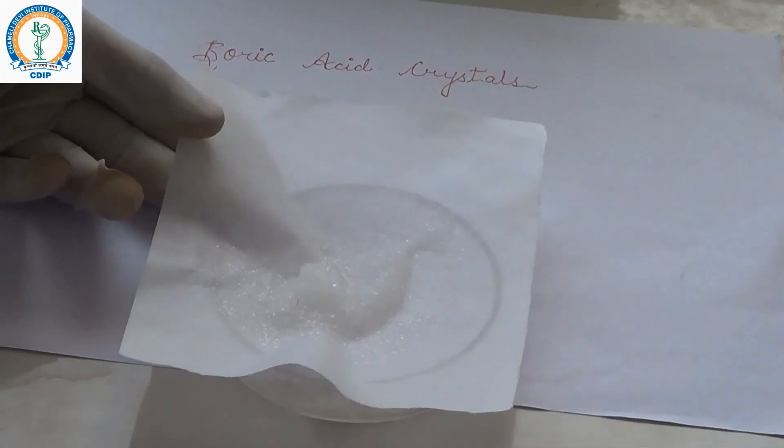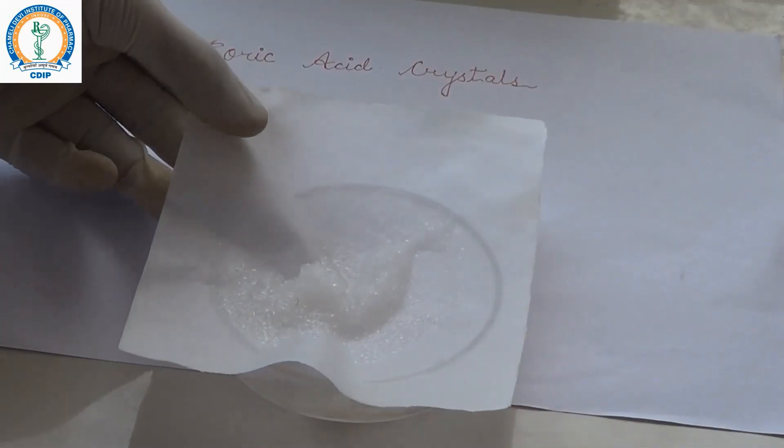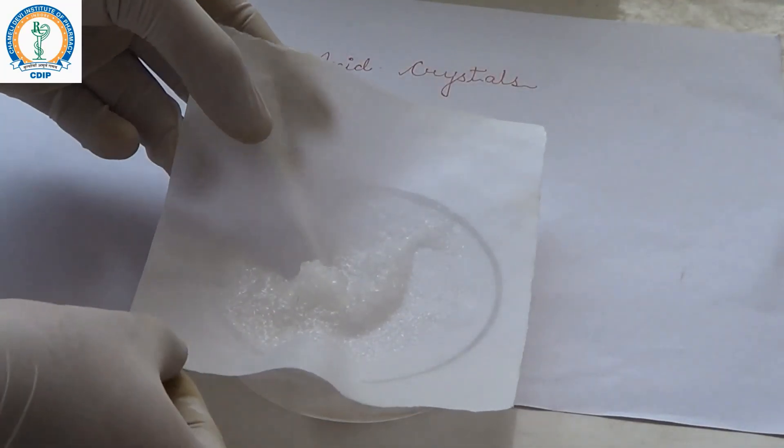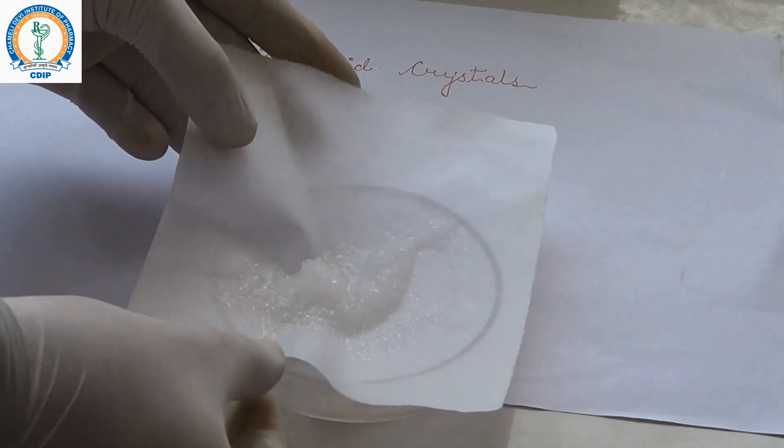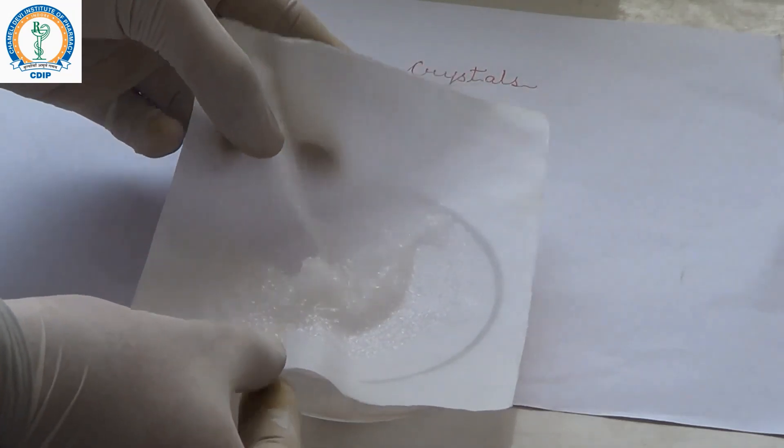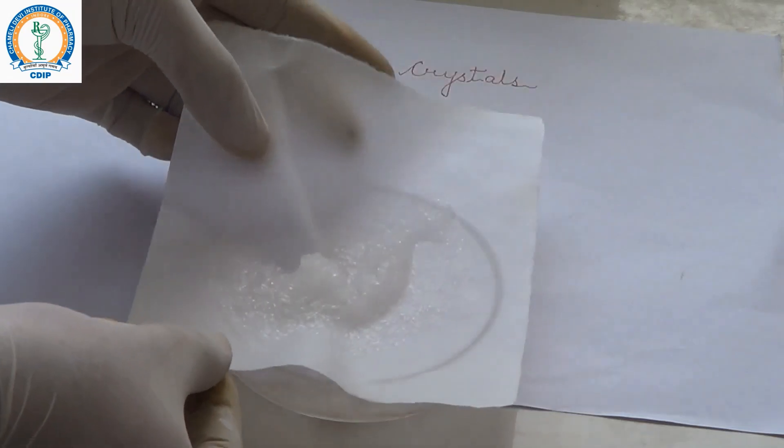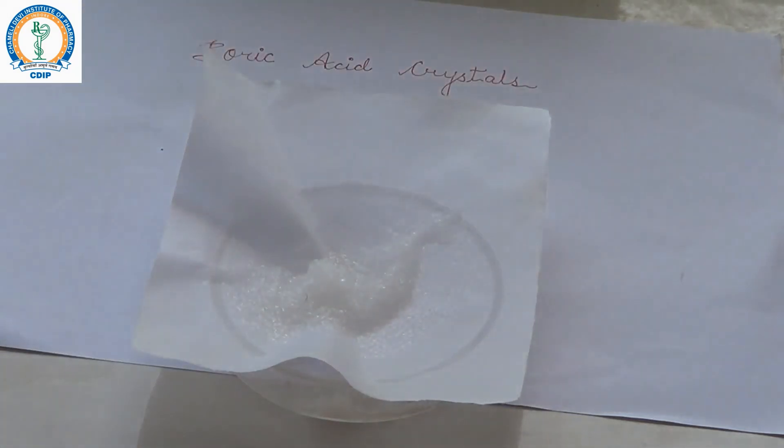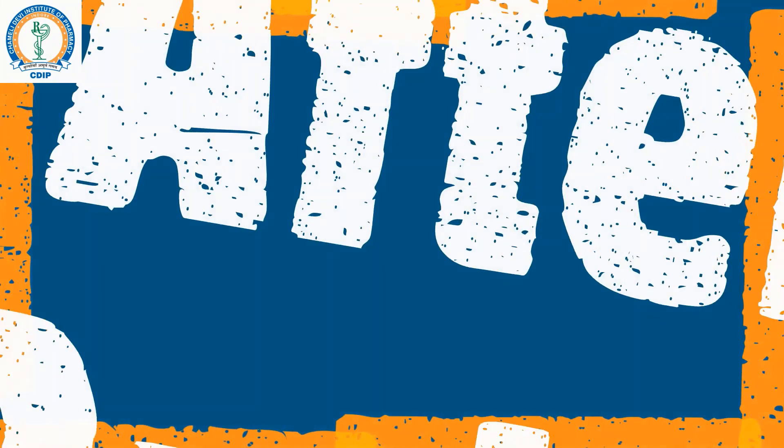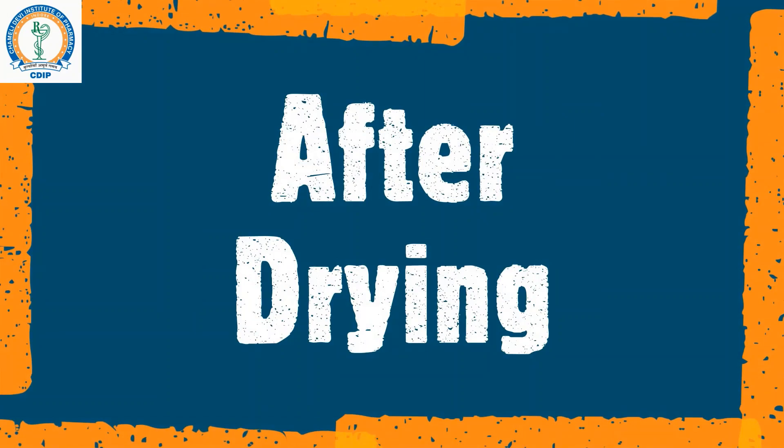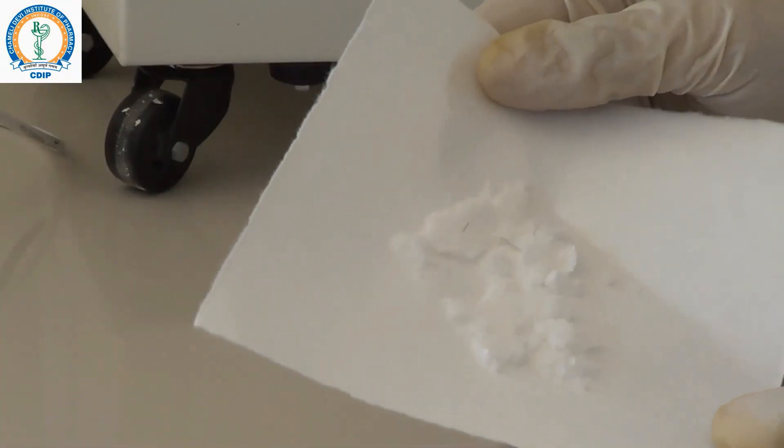After filtration, you can see the fine crystals of boric acid. After drying, you can see the final product of boric acid.